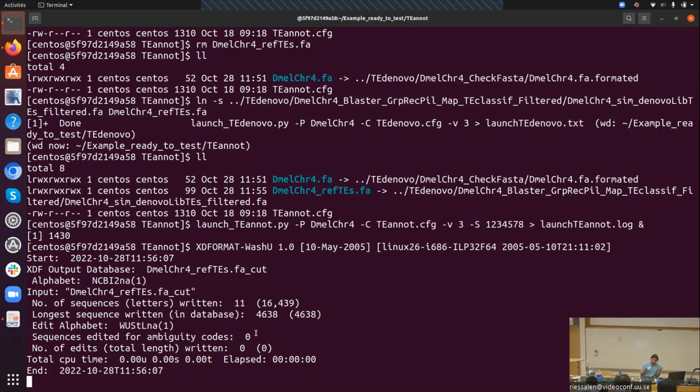Or, on the other hand, you can build your library with TEdenovo and then use another tool like REPET masker. Or use only PASTEC if you have a library for which you need a classification. What you have to keep in mind for the usage of PASTEC is that the classification will depend on the quality of the bank that you are using. So it's better to select a bank that has references close to your species.